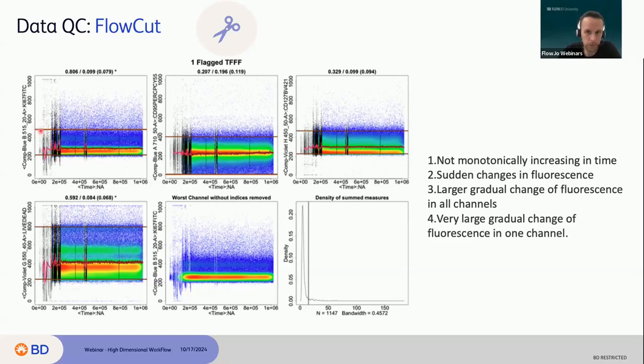Also on the top and the bottom, you have your 98th percentile and your second percentile, before cleaning and after cleaning. The light brown is before cleaning. Your dark brown is after cleaning.